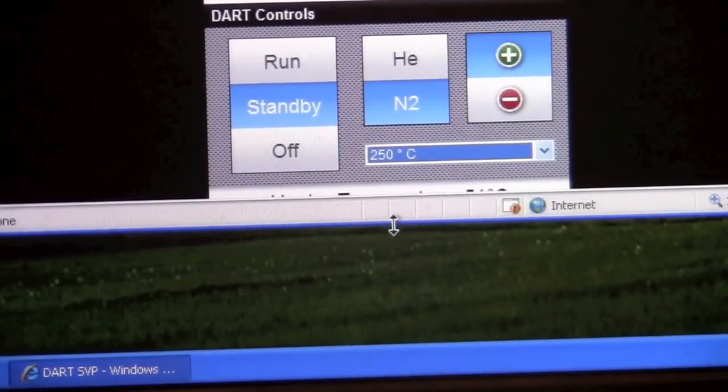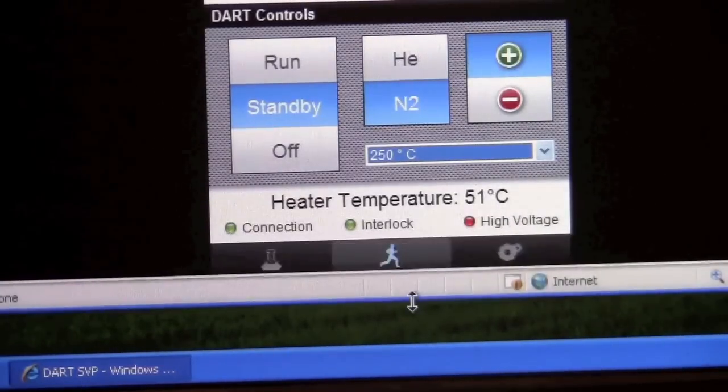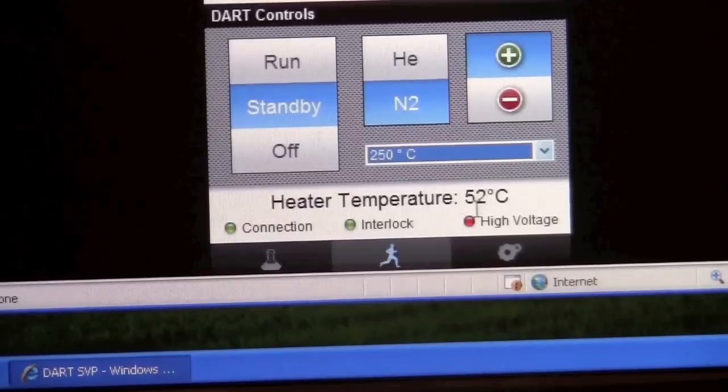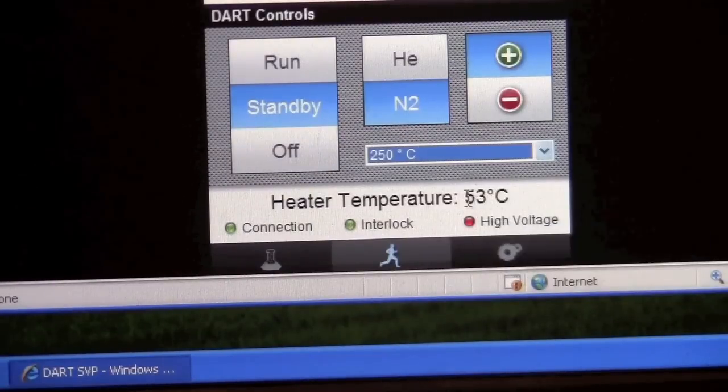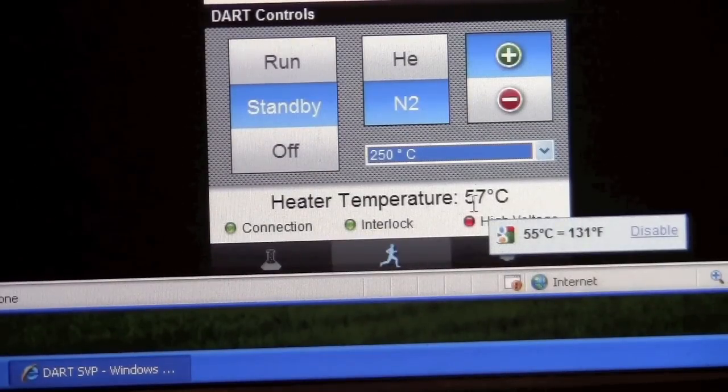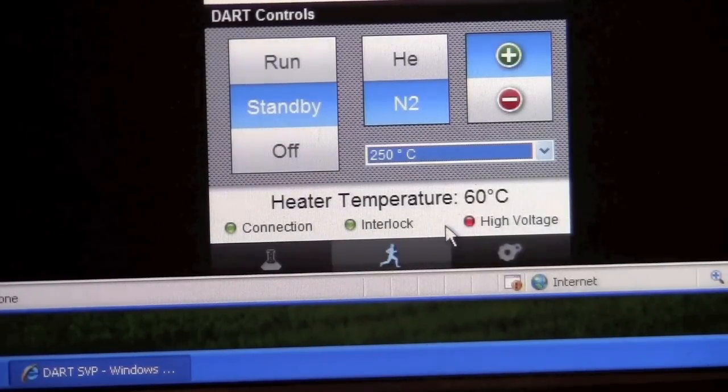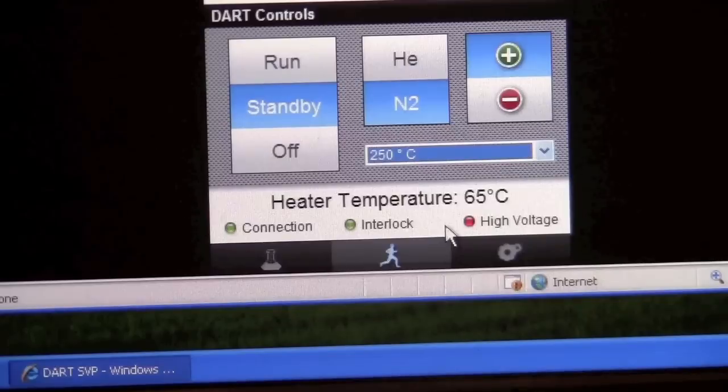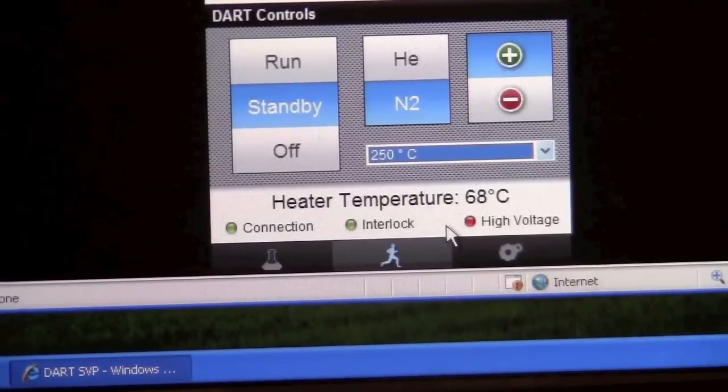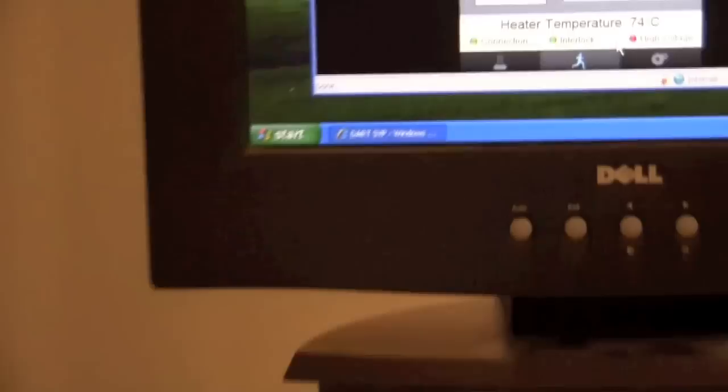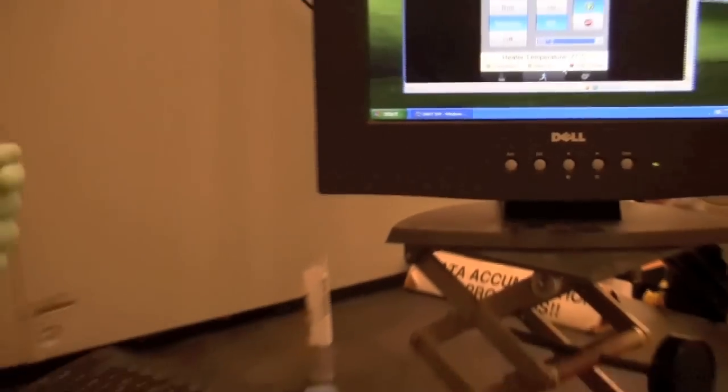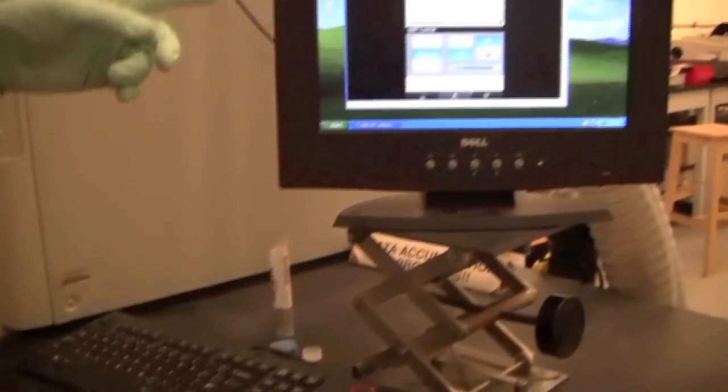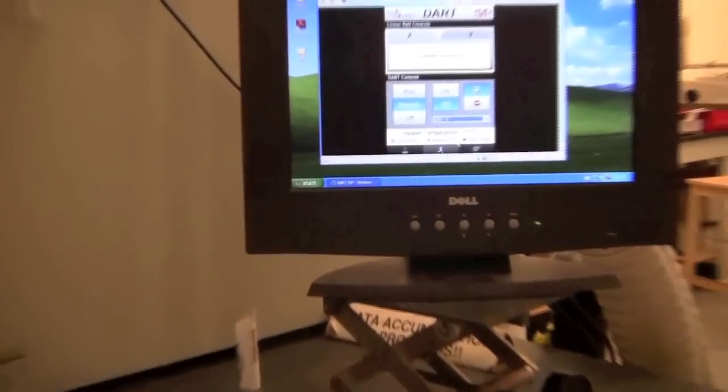It will start ramping up the temperature and we need to wait for it to get up to the target temperature. While we're waiting for it we can turn the vacuum pump on. There's a small vacuum pump that draws ions into the mass spectrometer. We can go back and watch the temperature ramping up.